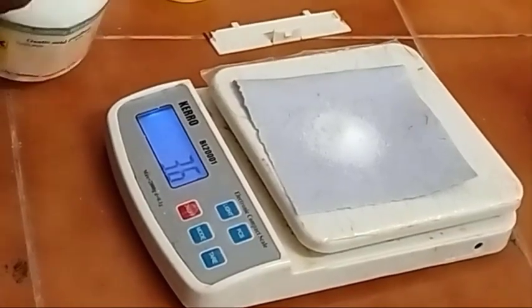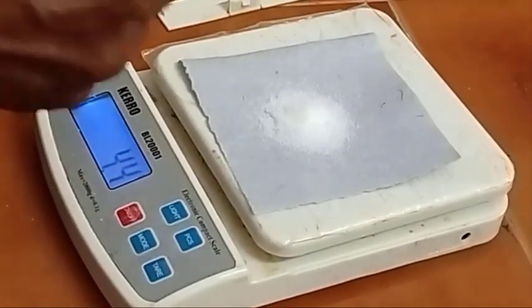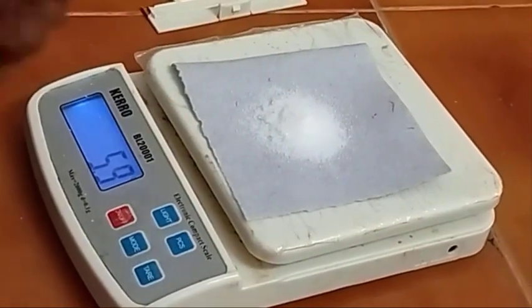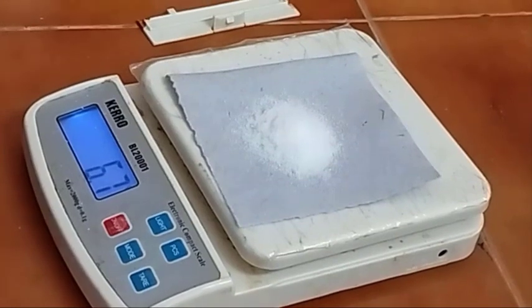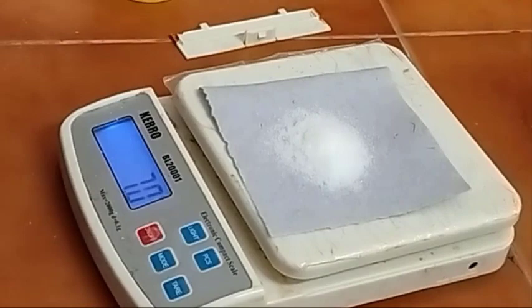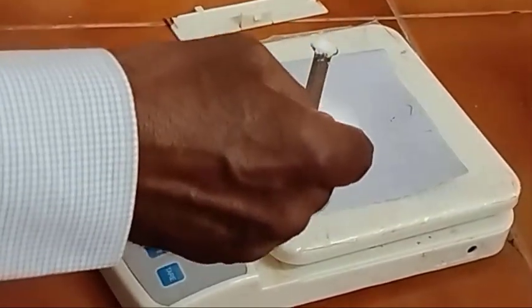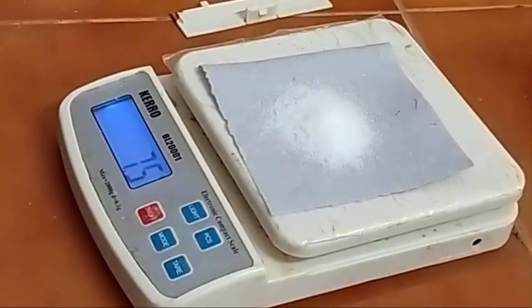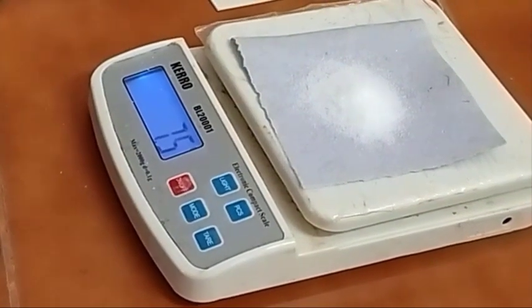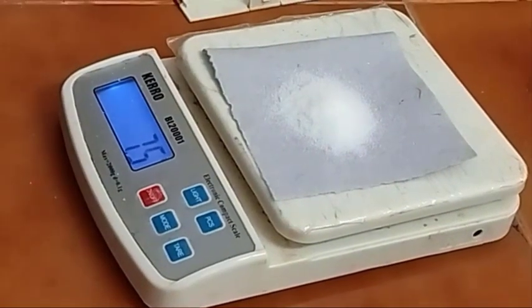So now previously the weight of the paper is 0.9 grams. Now 6.3 plus 0.9, how much? 7.2. So even if 0.1 gram or 0.2 gram become excess, don't do anything. Right? Again we take the weight of the empty paper and we can calculate the molarity.